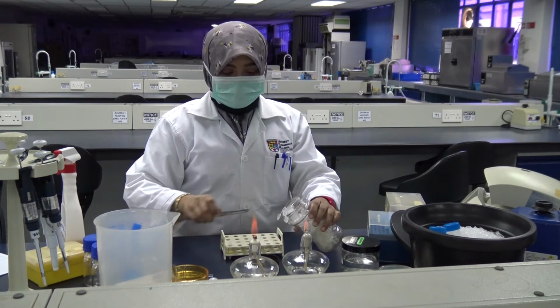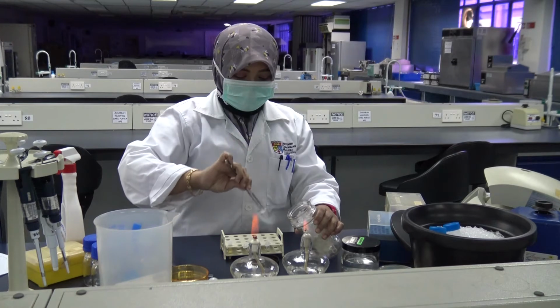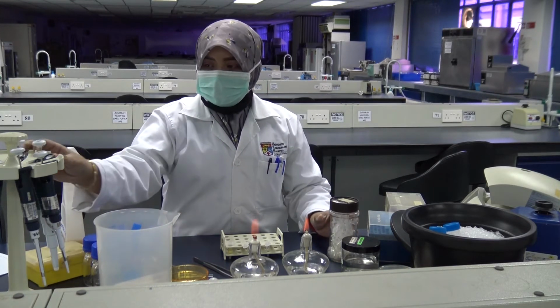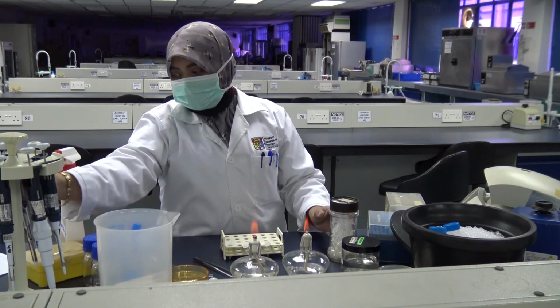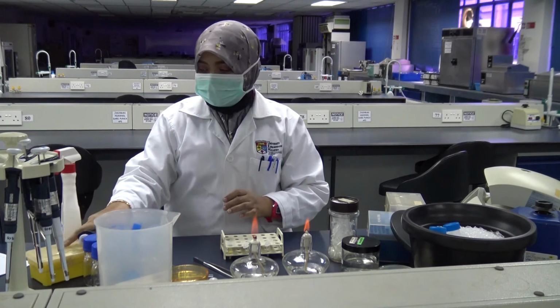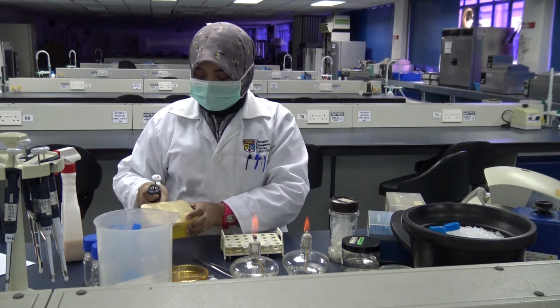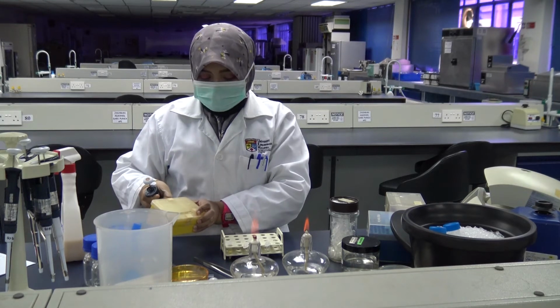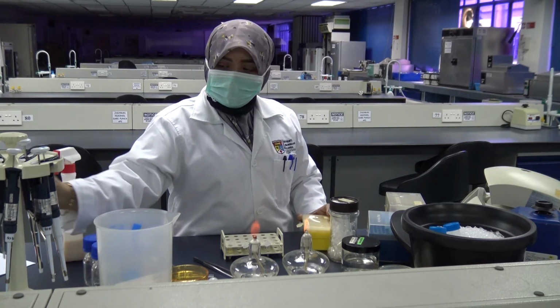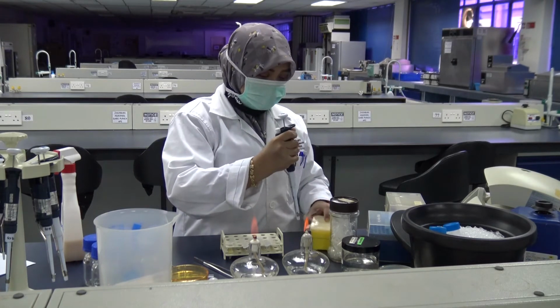You are to prepare 10-fold dilutions here, starting from 10 to the minus 0, 10 minus 1, 10 minus 2, 10 minus 3, 10 minus 4, 10 minus 5, and 10 minus 6. The diluent for this is nutrient broth. Since this is a 10-fold dilution in each tube, you need to calculate how much diluent you put in. You will be transferring 100 microliters into tubes minus 1 to minus 6, which means the nutrient broth that you should transfer into each tube would be 900 microliters.